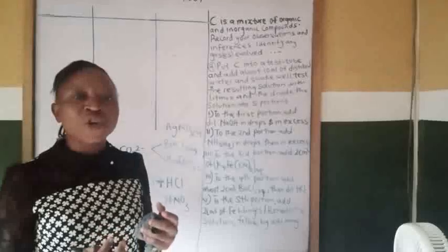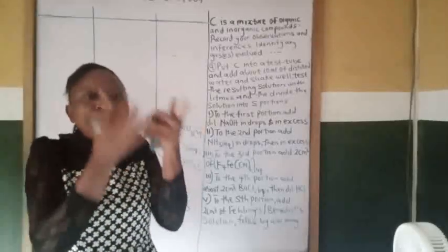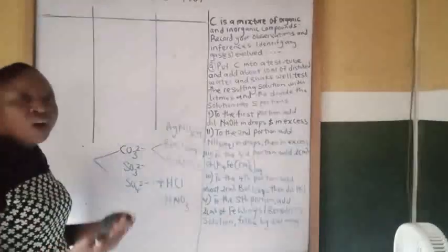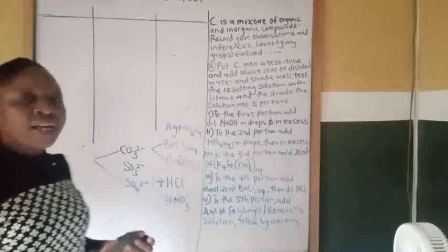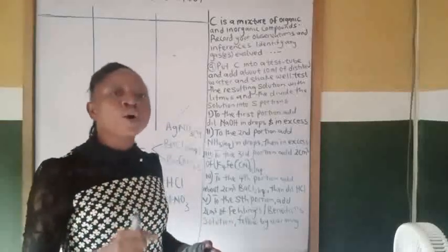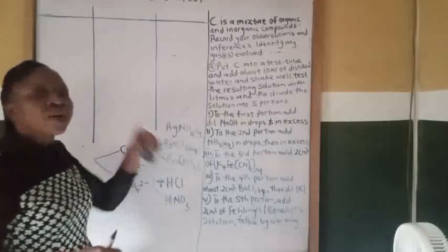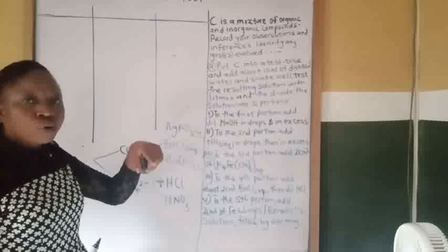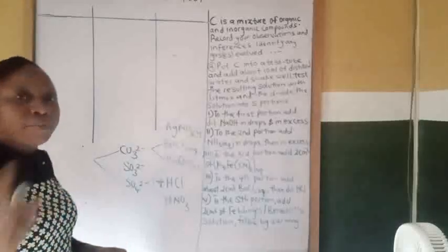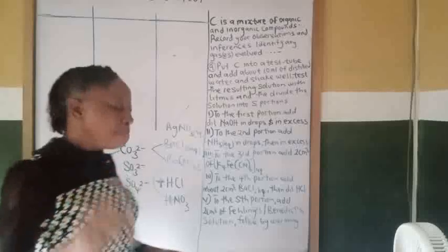Effervescence of a colorless and odorless gas, just as if you open a bottle of soft drink, it will start foaming like that. Then test that gas with lime water. If it is CO3, it will turn lime water milky.